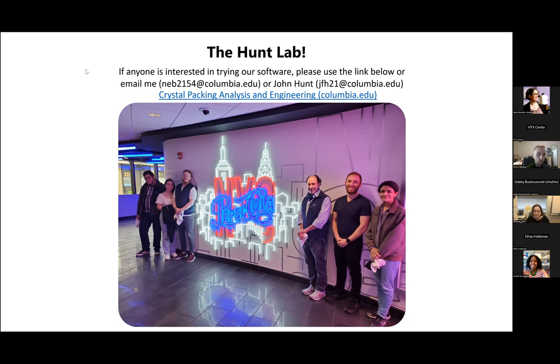Great, thanks for that follow-up. I have some other questions in the chat. From Anwar, they point out that they have seen a paper using arginine to asparagine for protein solubilization, and that also works. And they follow up with, what do you think would happen if you used arginine in the crystallization buffer instead of replacing your lysine with arginine?